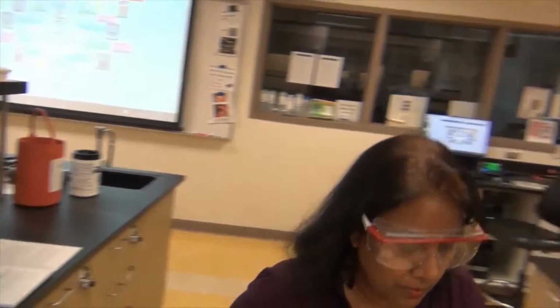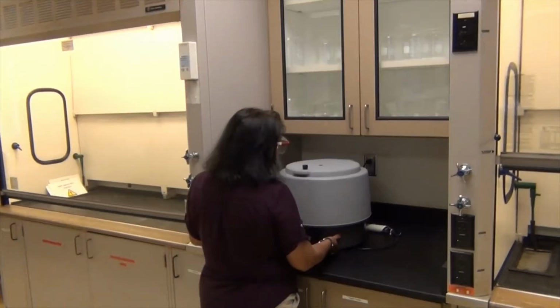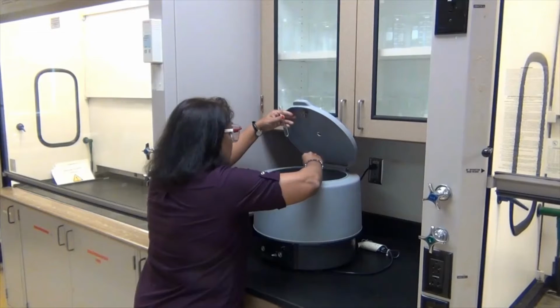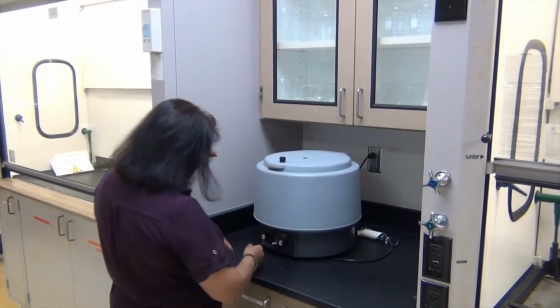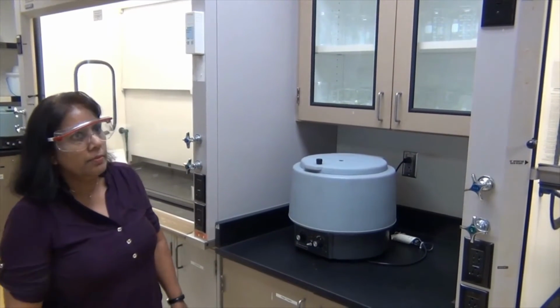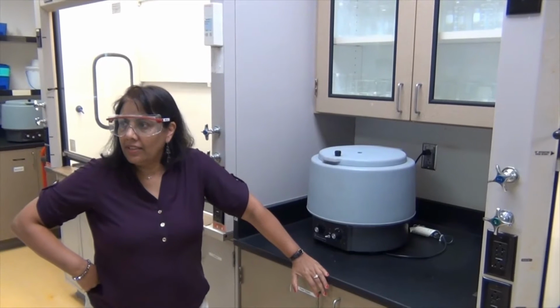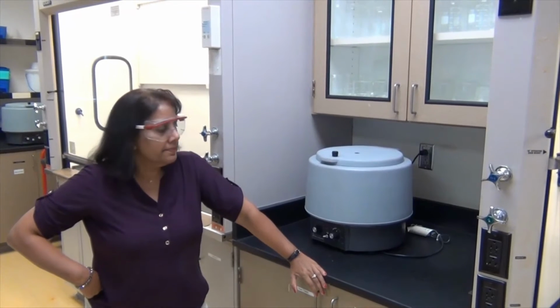Okay, so let's walk over here to the centrifuge. So you can see the video also that I have for the centrifuge, but otherwise the main thing about a centrifuge is to balance. And here I'm going to keep this on the opposite side, and now there's nothing exciting except to just turn it on for about 1 minute, and you can hear it. We'll just let it go for a minute. So waiting. I'm looking at the computer time.